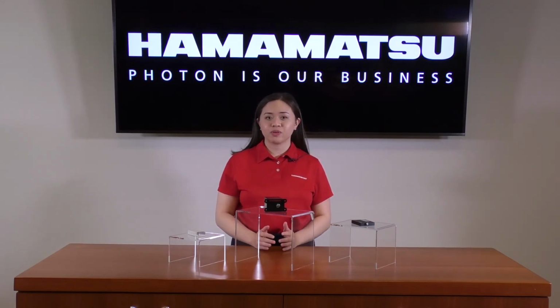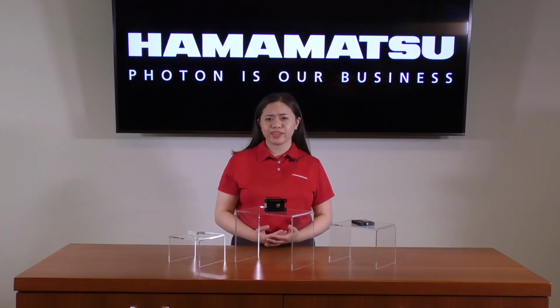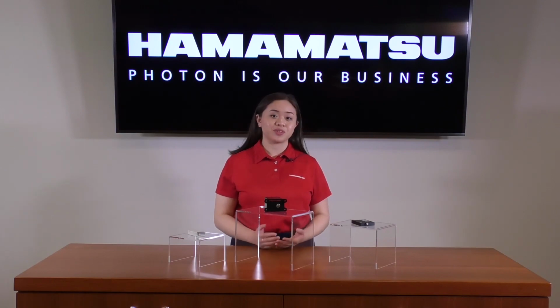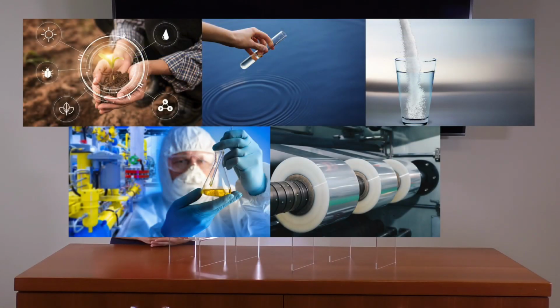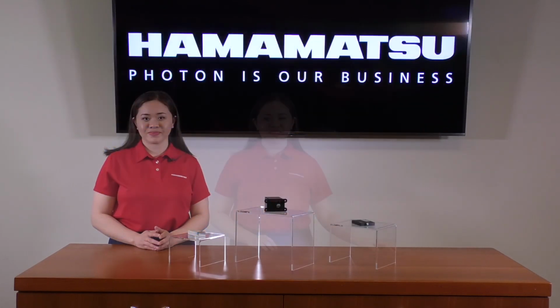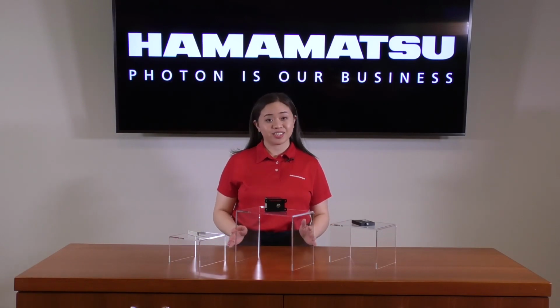Now, although this video focuses on the use of NIR spectrometers for the pharmaceutical industry, we understand that these spectrometers can and have been used in many other markets. For example, these technologies have been used in precision agriculture, moisture content monitoring, sugar content measurement, industrial chemical analysis, and thin film measurement.